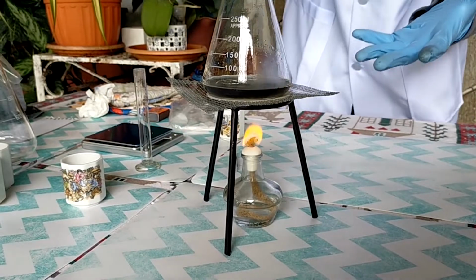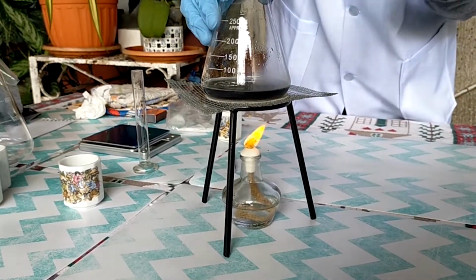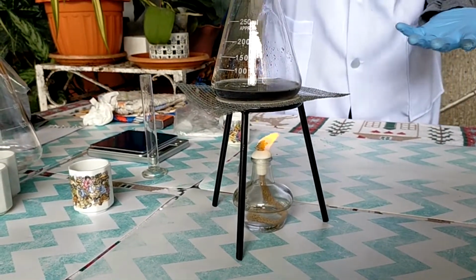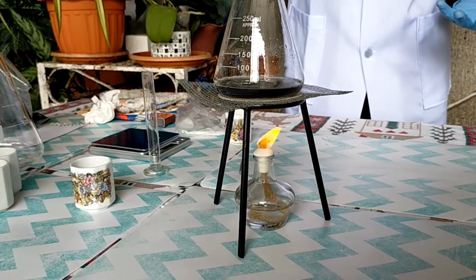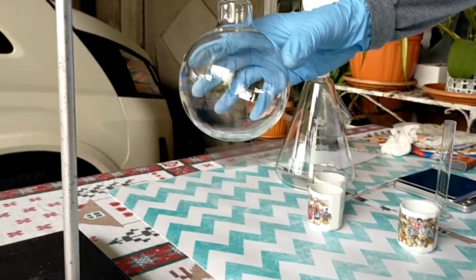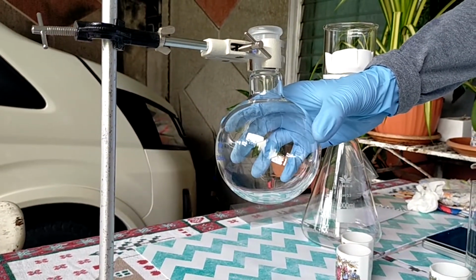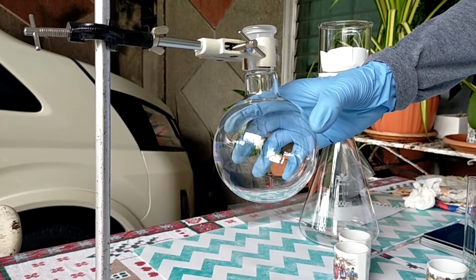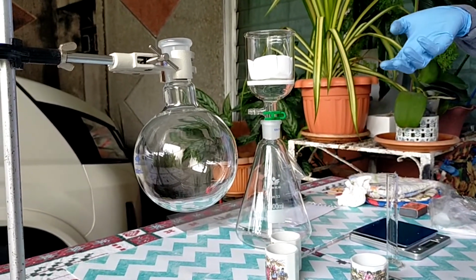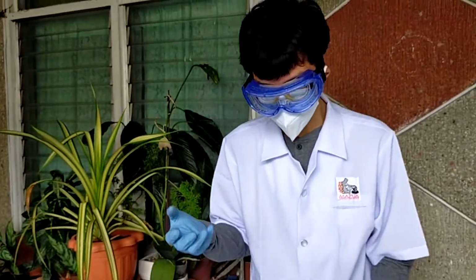Now, as our mixture here, which contains the ethanol, the naphthalene, and the charcoal, is heating, I will just prepare a small amount of ethanol here, and I will heat it because we cannot make use of vacuum filtration, since we do not have the appropriate apparatus, so we will use gravity filtration. So we will aid it with hot solvent.